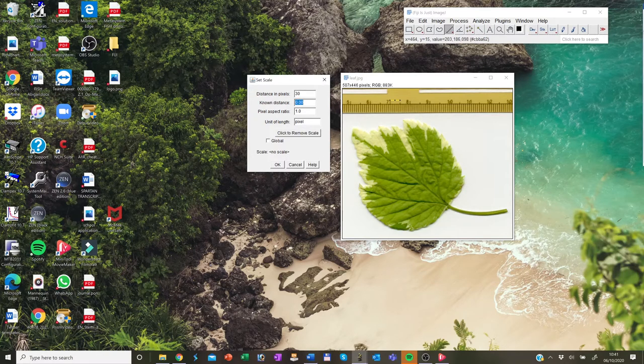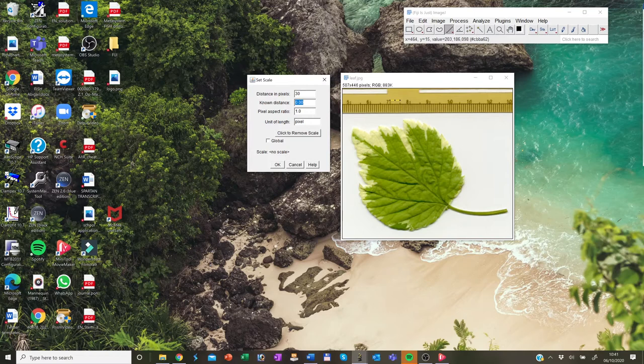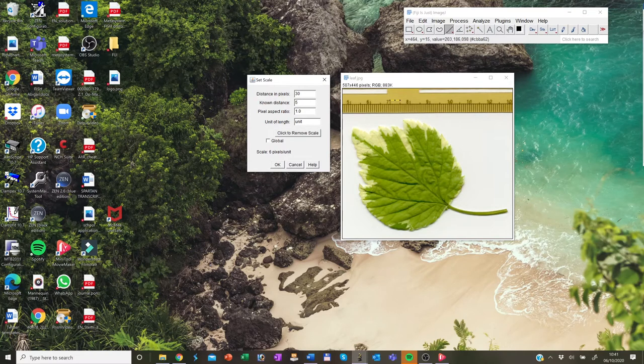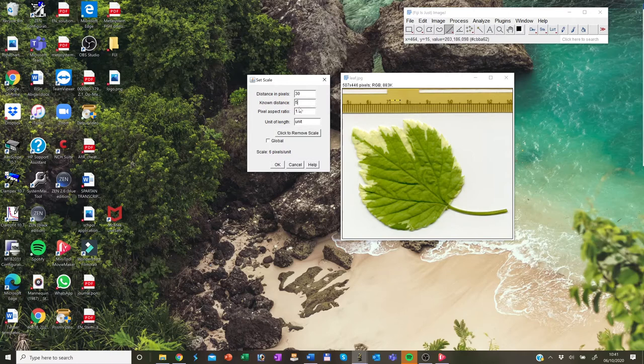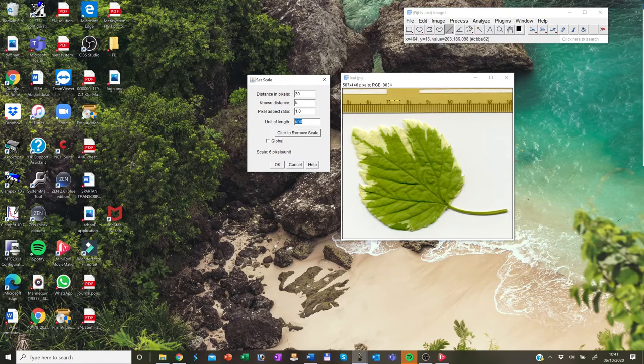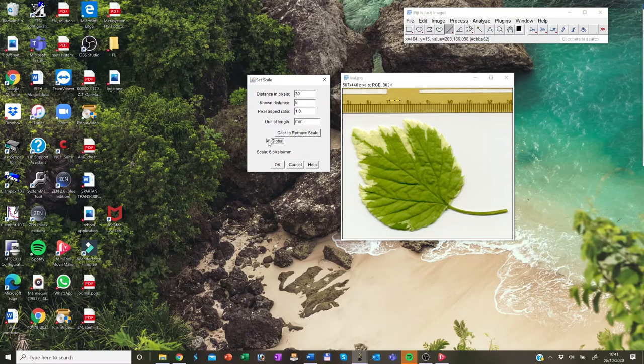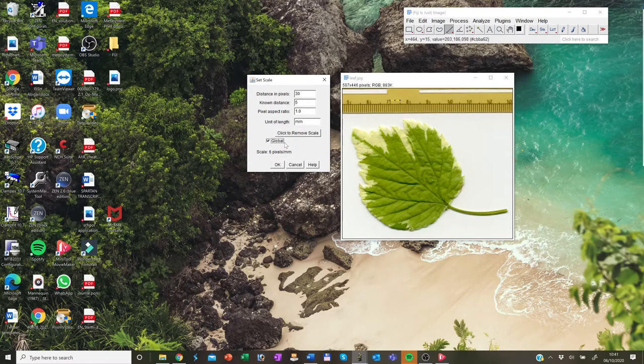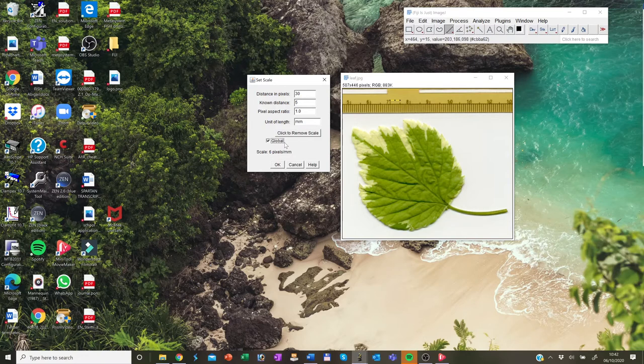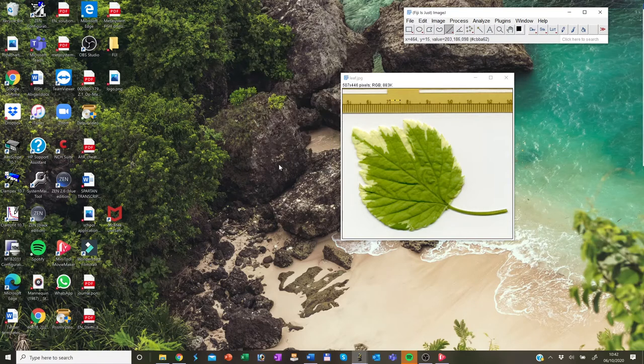In this case, we had five millimeters. So you fill it without the units. Define the units of length in the unit of length window and we put in millimeters and you click on the global so that this calibration applies to all images that you open in this ImageJ session and then you click OK.